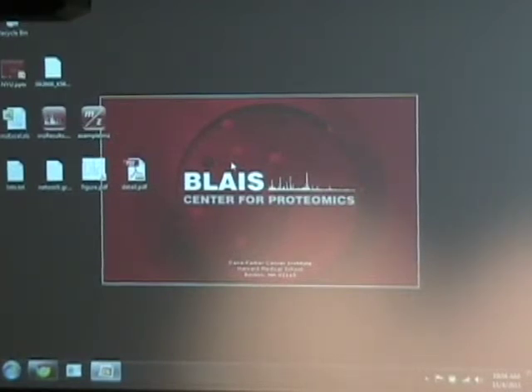So people have tried to get to this point where we can share every aspect of the data. But for example, Tranche has had some technical difficulties and is not currently funded. So it's sort of running in a little bit of a Mad Max mode where we're just sort of maintaining it.